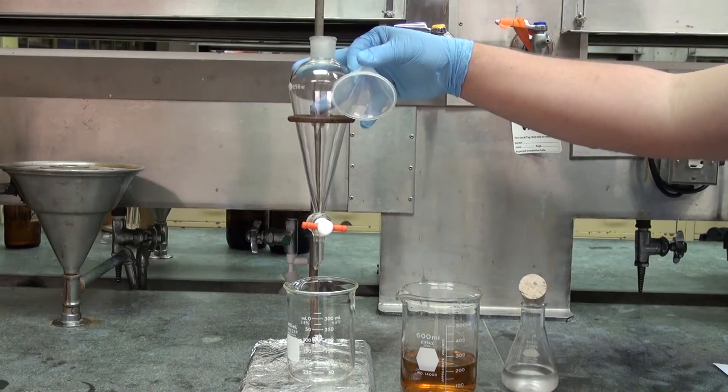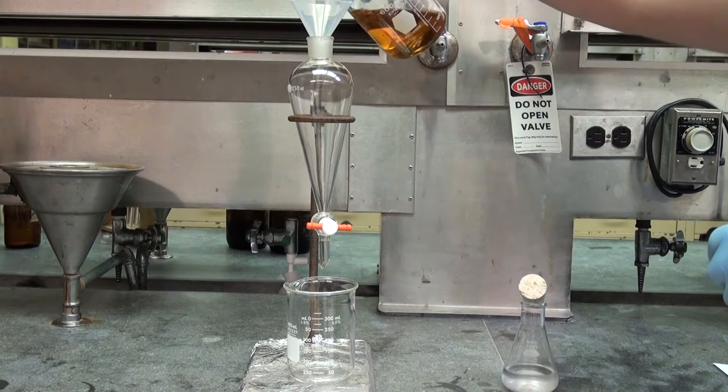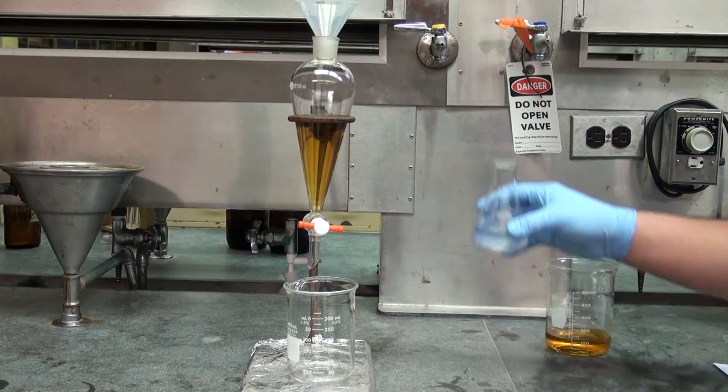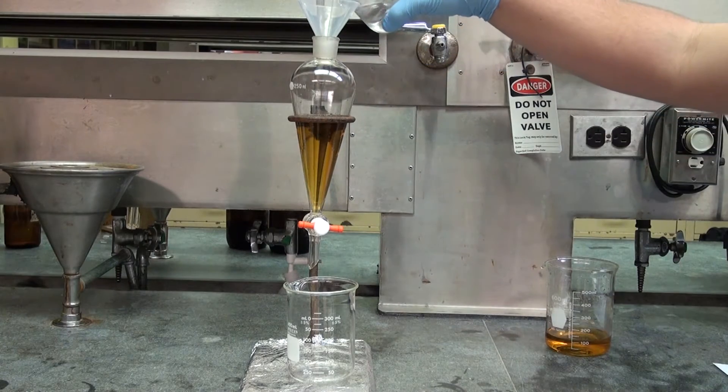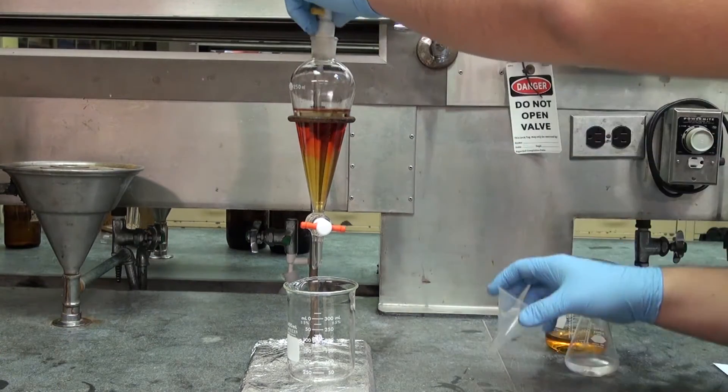First, add the solution you want to extract in the separatory funnel. This is an aqueous layer we want to extract with diethyl ether. Therefore, the organic layer solvent is added, which is diethyl ether. Close the lid.